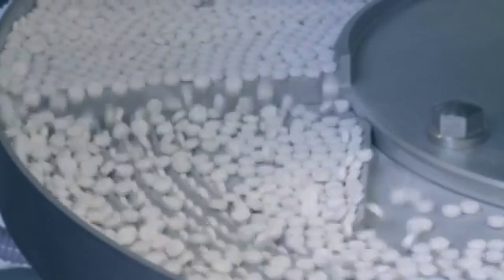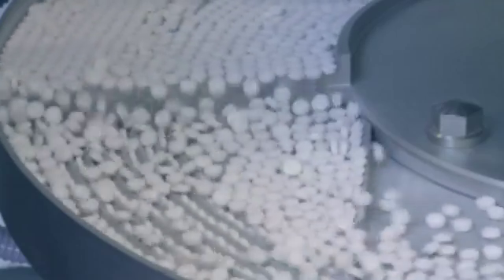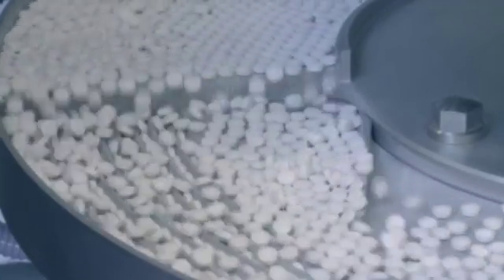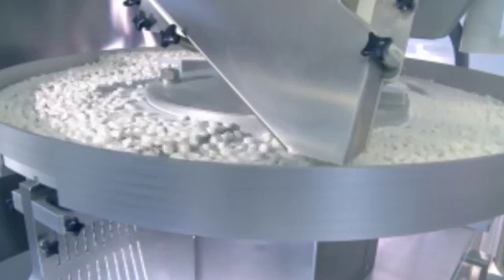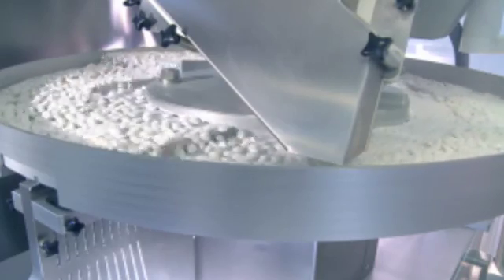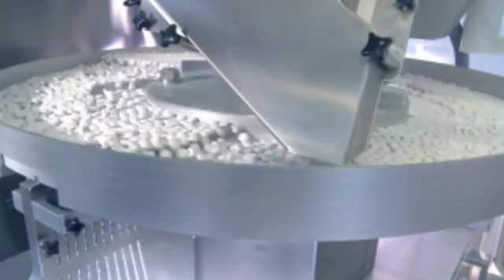A manufacturing plant producing aspirin tablets needs to routinely check that each batch of the tablets are consistently the same. A key test is determining the exact amount of aspirin, the active pharmaceutical ingredient in each tablet.